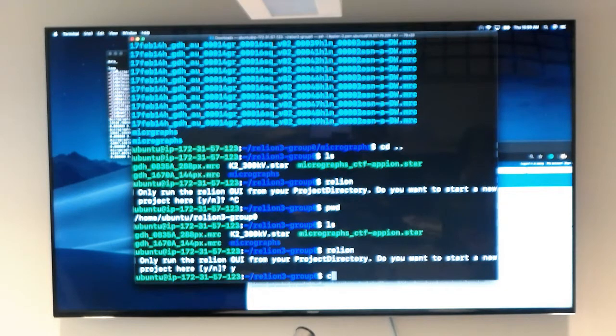We'll have the instance open all day, so for the first part we're going to go over Relion. We'll take a break, obligatory pizza. You don't have to eat the pizza. And then we'll hop into CryoSPARC. And then just to give you an intro, at the end, before we take a break, I'm going to go over each of the modules. And you may not be able, within the time allotted, to get through the whole tutorial, but I'll give you a snapshot of the results that you would get.